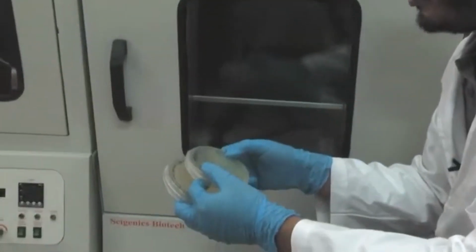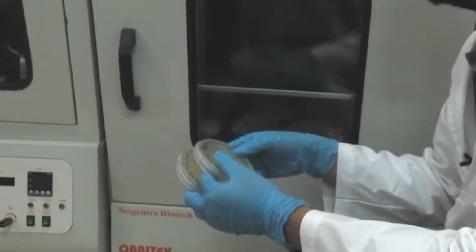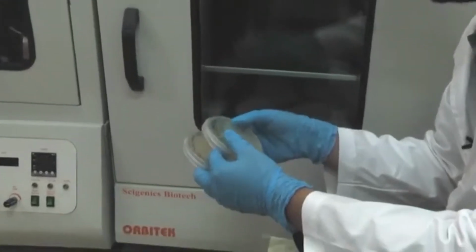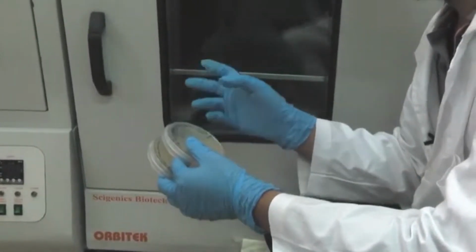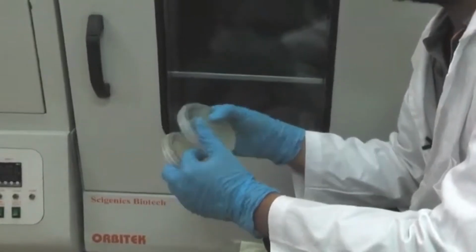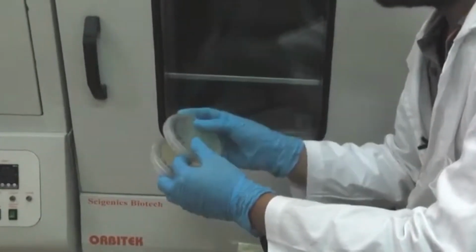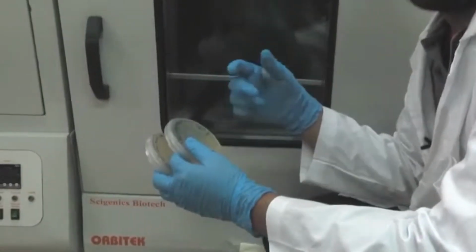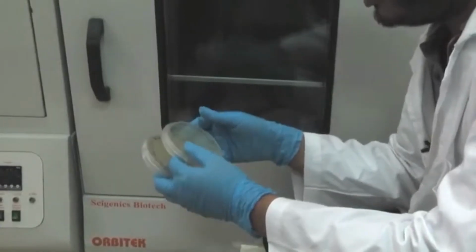So, yesterday we had put two plates containing our ligation product transformed into DH5 alpha competent cells and plated onto LB agar containing the appropriate antibiotic. Those two plates, this morning I came and collected them, sealed them with parafilm and stored them at 4 degree centigrade until further need. So, I have taken them out and I am going to show them to you.